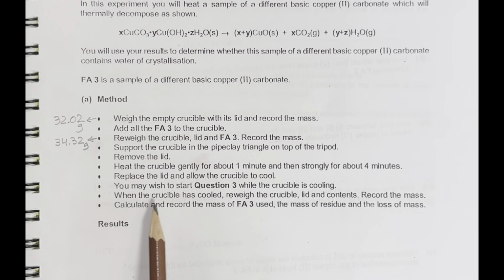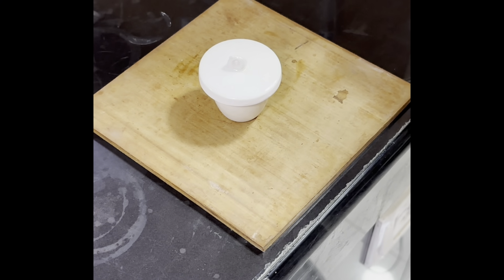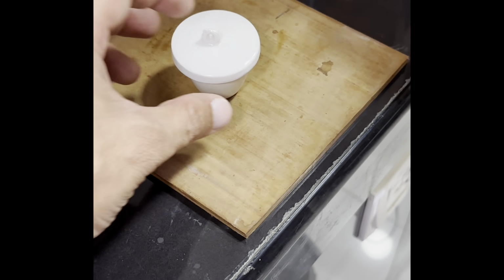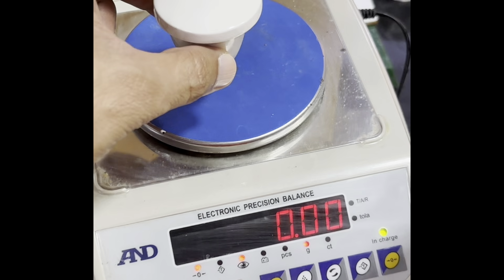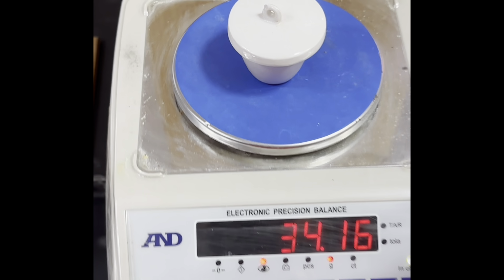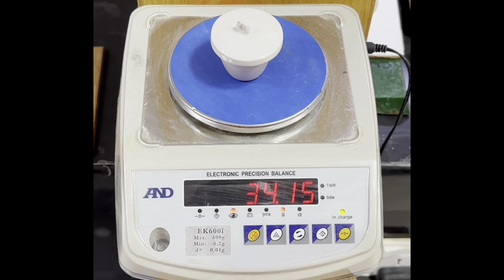Now, when the crucible has cooled, reweigh the crucible, lid and contents, and record the mass. Now, let's reweigh the crucible when it's cool with the lid. 34.15.